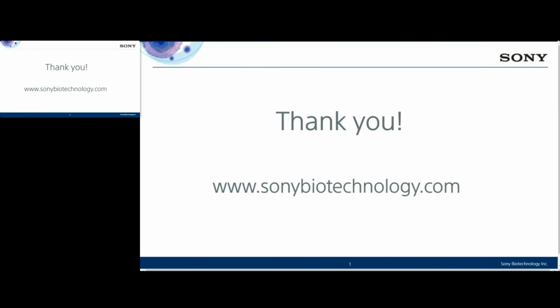Our first question, it looks like, is for Jerry. That question says, how many lasers and how many parameters can be used with the CGX10 system? Well, thank you, Cassie. So the system has up to 4 lasers and can detect 8 fluorescent parameters as well as forward and backscatter, so 10 in total.